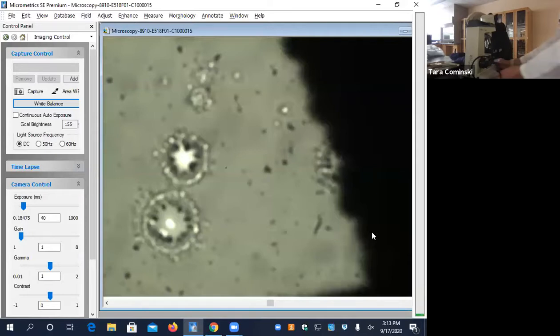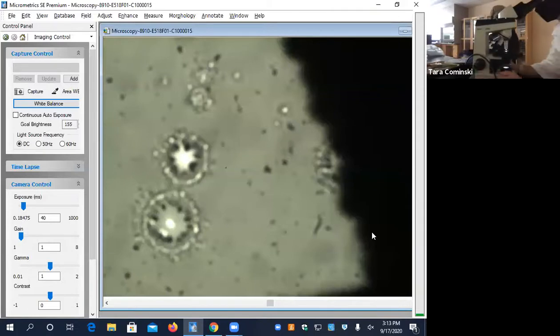Did you get it or you completely lost it? Yeah, so then best, you can even just go all the way back here, get it back in focus. I see it there, I think. There it is. Yeah, it just got out of focus. And then you can switch back. All right, if I'm not mistaken, blue is 40, right? Correct. Blue is 40. Yep.